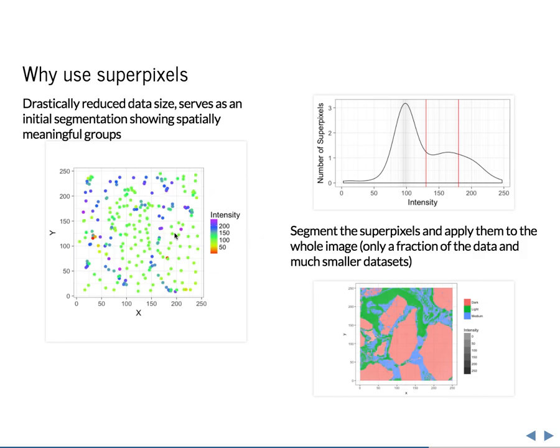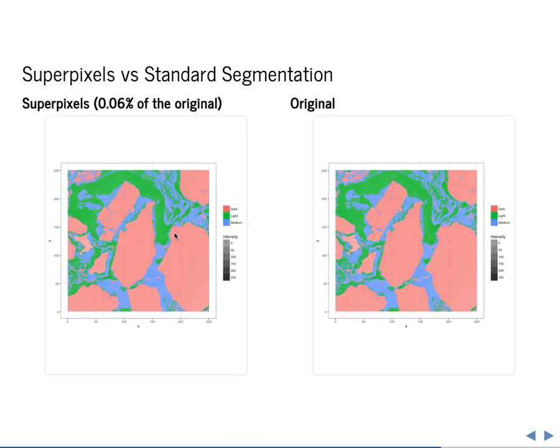It also is very important when we start to talk about more advanced analyses that you can do, that if you're looking for objects that are vertically oriented, a pixel can't really be vertically oriented, but a superpixel can. And so you can perform shape analysis and texture analysis on these groupings much better than you can of individual pixels. And so it's a significant reduction.